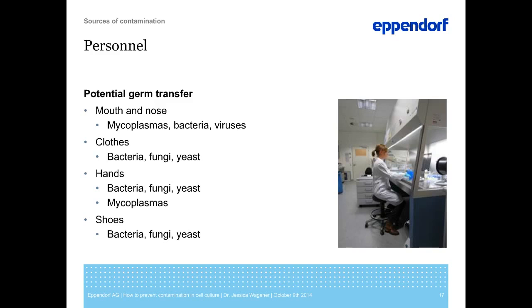This is not where they normally grow, but if we touch our mouth or scratch our face, they might stick to the hands. The shoes are also a major source of contamination. They carry traces of soil and dirt, and we carry the microbes that are in there in our cell culture lab if wearing street shoes there.